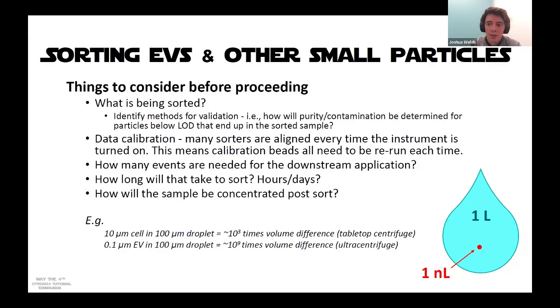It means that you will also need to concentrate, because you basically have a 10 to the 9 difference between a single particle and the volume that it's diluted in. And then when we concentrate, we lose particles. It's just not a very practical solution, even if it worked perfectly.